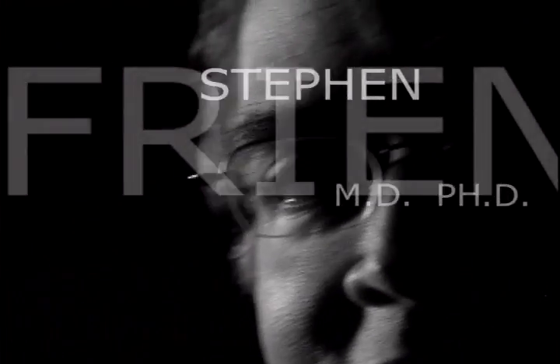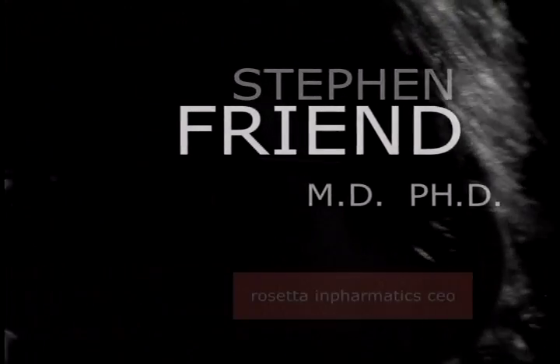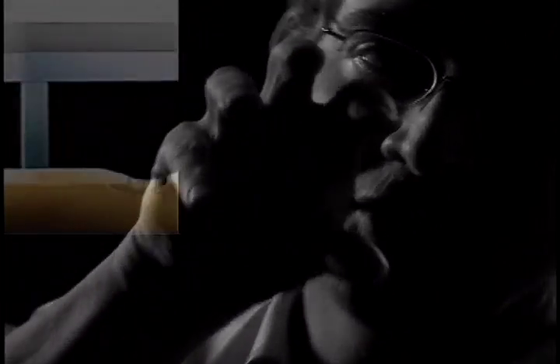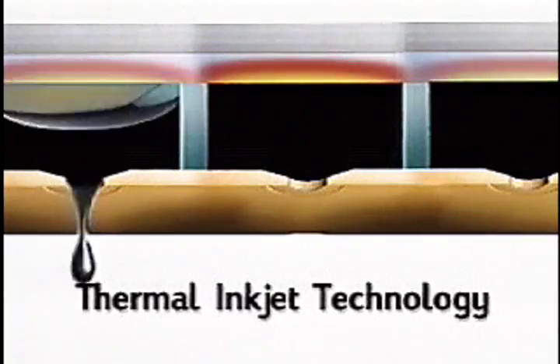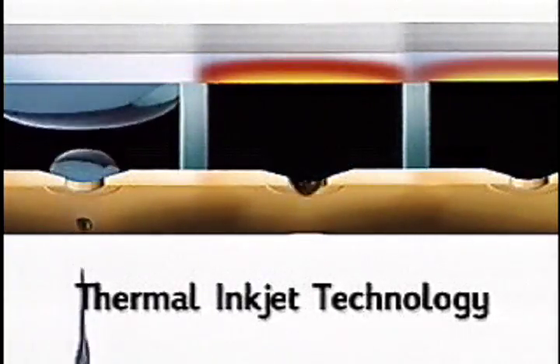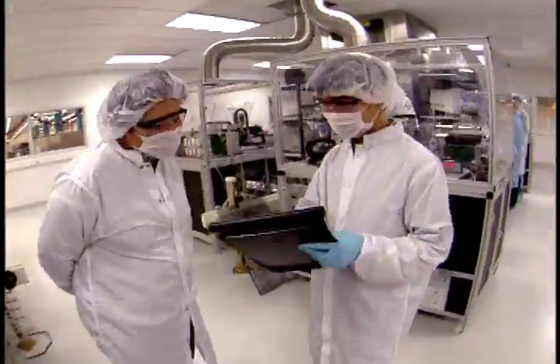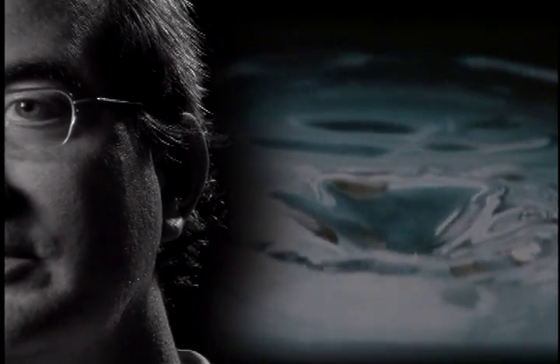Inkjet technology has the precision that's come from decades of work in being able to precisely put down a specific compound or chemical at one location or the other. And the inkjet arrays therefore have a sophistication in terms of quality, robustness that you just can't get if you're pasting fragments of genes onto glass.